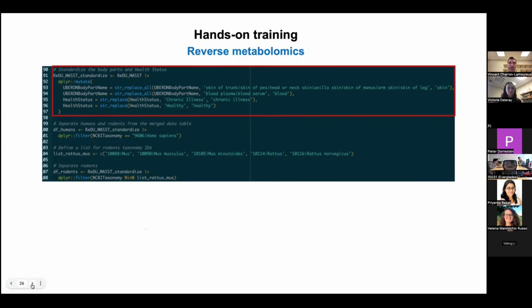If you are interested in studying a particular molecule found at a specific skin location, you can comment out that line and activate the other line. Here, to ease the analysis, we just combine all the skin together, but know that it's possible to inactivate that line to study a specific skin location. Same for blood, if you're interested in the different plasma or the serum.